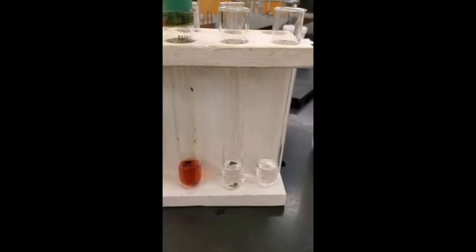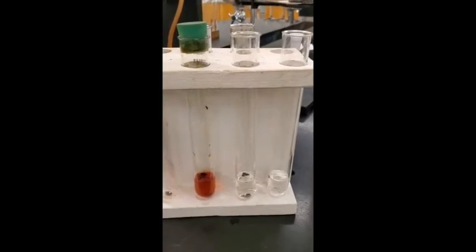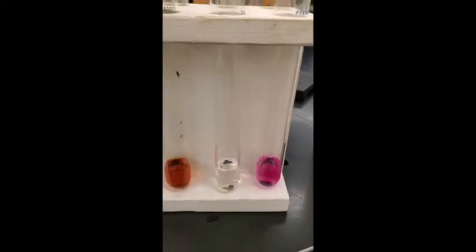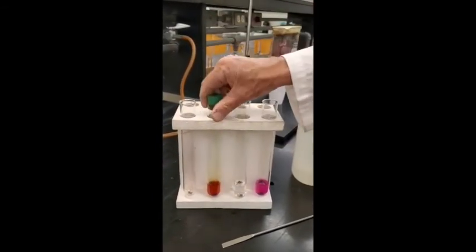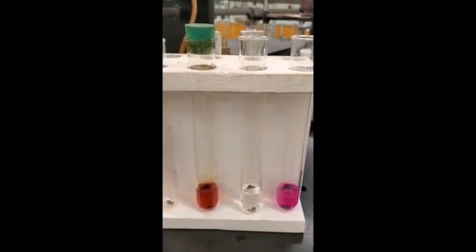And now the last one's got naphtha in it, and iodine is soluble in hydrocarbons because it's a nonpolar molecule, and it should be soluble in there. Let's see if it is. And then we get the purple color of iodine. So it is soluble in the hydrocarbon nonpolar solvent. Not soluble in water, but it does react with the iodide ion to form the triiodide ion, which is intensely colored. So only a small amount dissolves, but as more and more dissolves, we're going to get browner and browner in color.